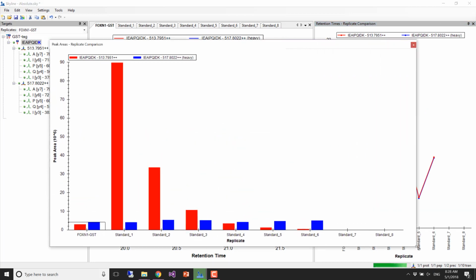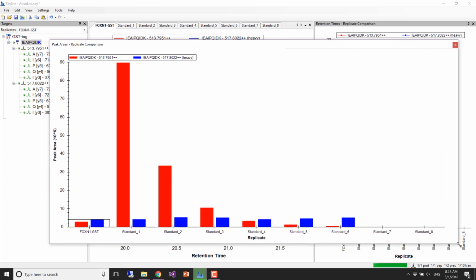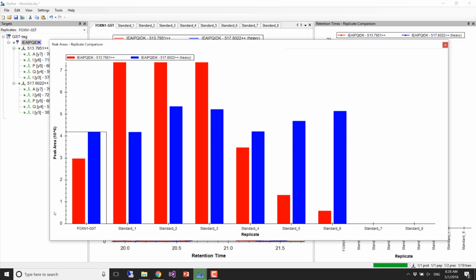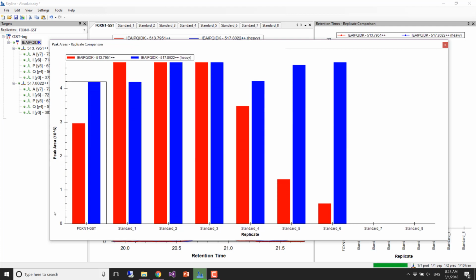so you know that there's five femtomoles of the heavy. What would you estimate there is of the light if you use the assumption that when they're equal, the heavy and the light are going to be equal, and there's basically a 1-to-1 slope? Yeah, so it might be 4 or high 3 or something like that. That's an estimate. That's one estimate.